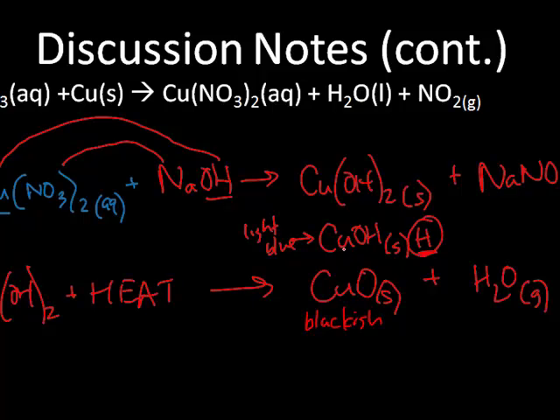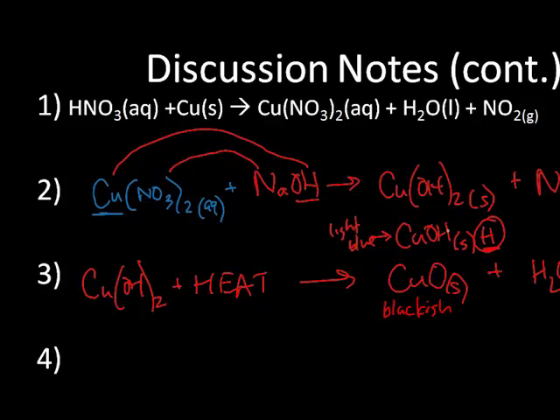However, some of you may have gotten a light blue substance. This is copper hydroxide, and the reason copper hydroxide might form is there were more hydrogens floating around in solution. This could have been because of extra nitric acid, but this sometimes happens upon heating.